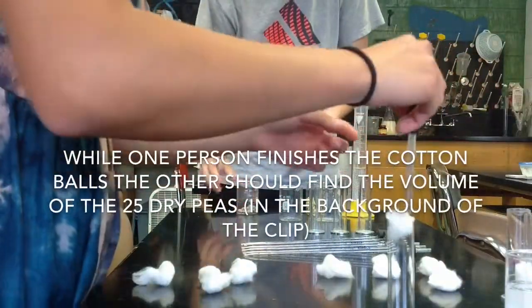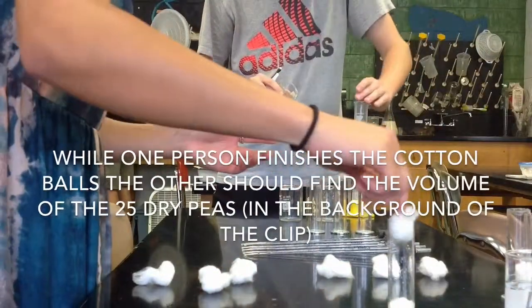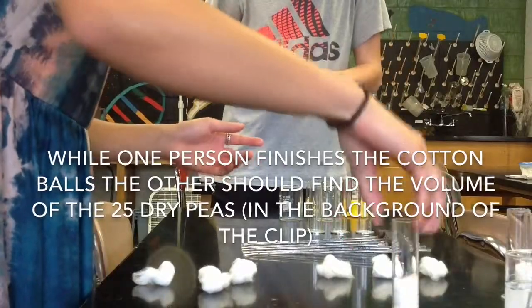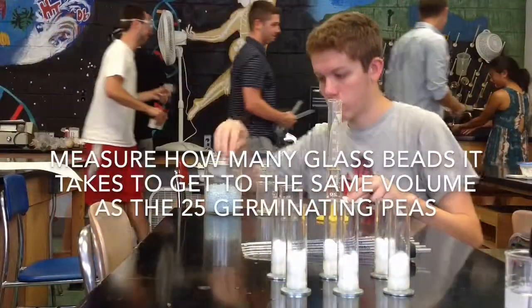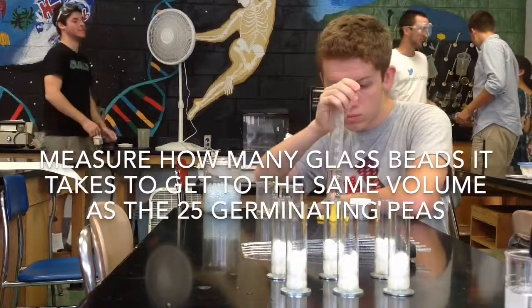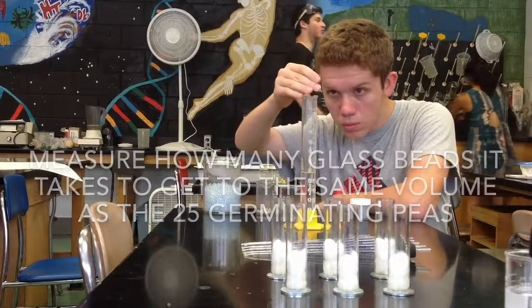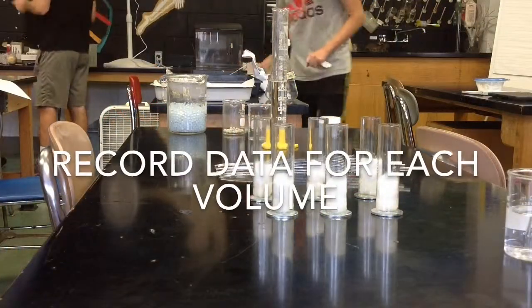Ninth, while one person finishes the cotton balls, the other should find the volume of the 25 dry peas, which is shown in the background of this clip. 10th, measure how many glass beads it takes to get to the same volume as the 25 germinating peas. Record data for each volume.